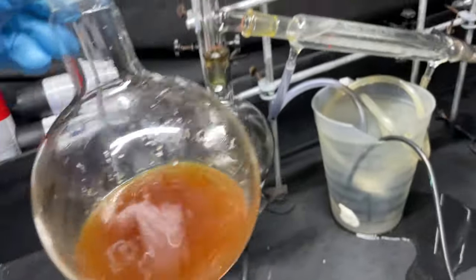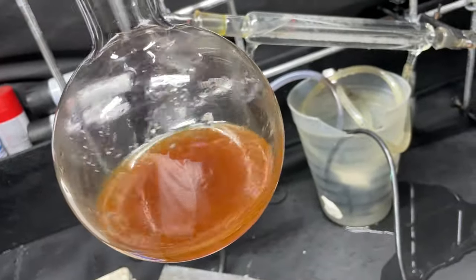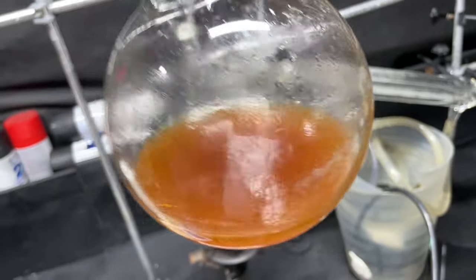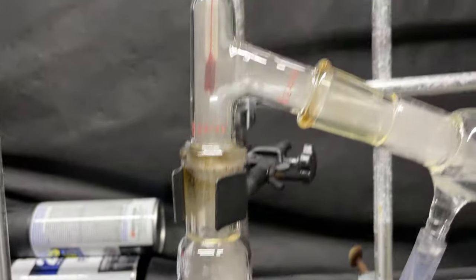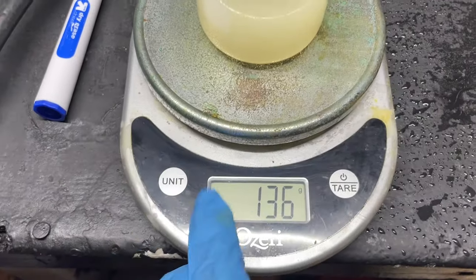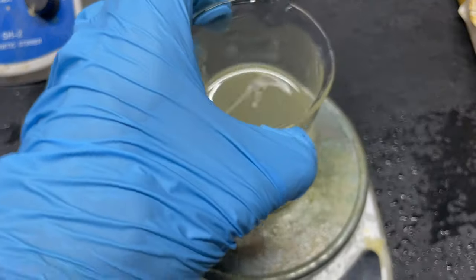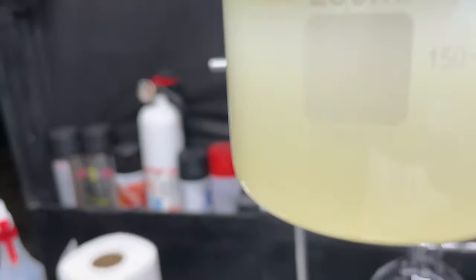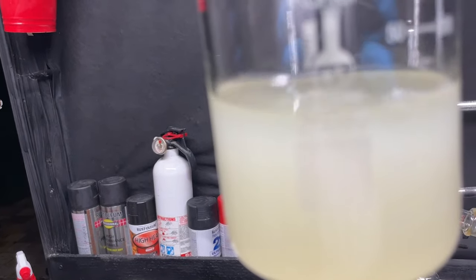Now I'm going to go ahead and distill this again and collect up to about 200°C fraction, and that will be the one we keep. Up to 200°C is practically our monosubstituted aromatics, a little bit of disubstituted aromatics, and things of that sort. Our final yield is 136 grams. This mainly consists of probably styrene as the main constituent. It is a little cloudy still — that is just because there is some water in there, but that will not affect anything in this reaction.